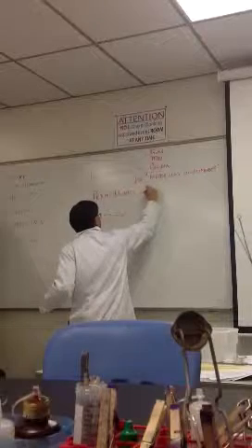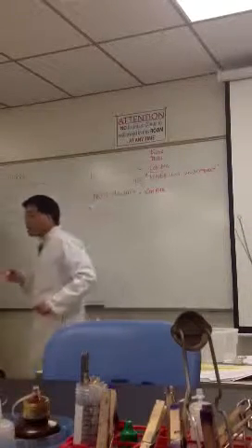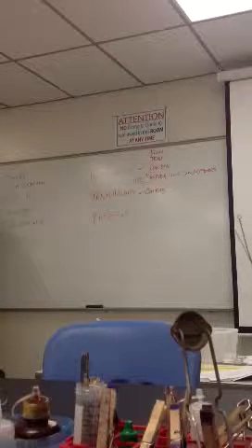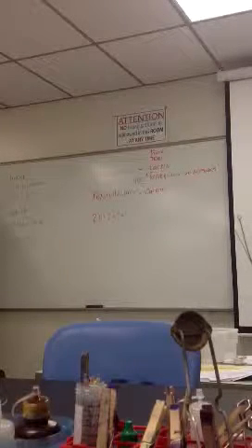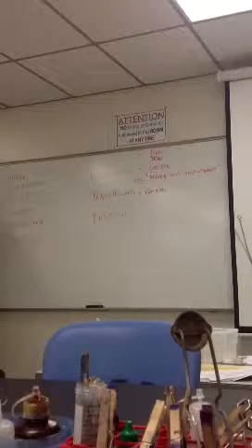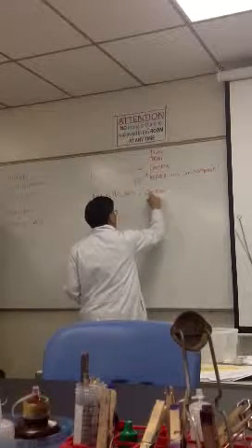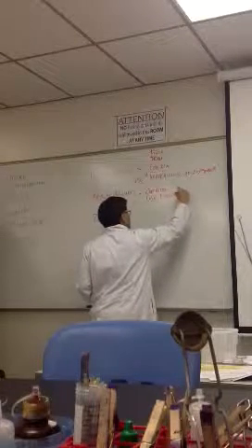Penicillium. You're going to draw the conidia again. This one makes conidia. Okay? And for this, I think you can use any slide except you don't want to use the orange one. So for this one you want to use the Penicillium wet mount. Penicillium.